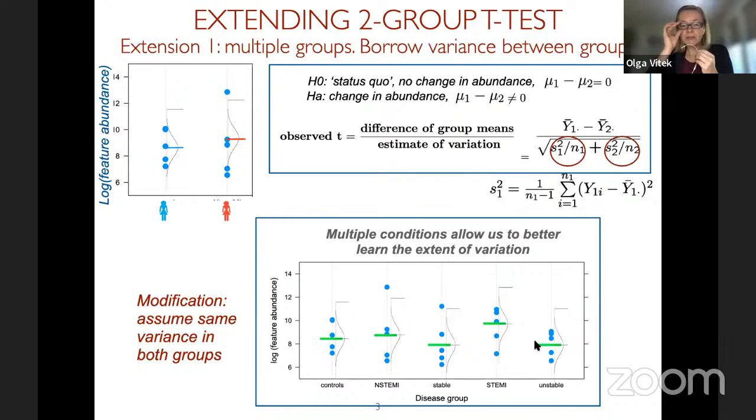And so the question was whether MSstats or MSstatsTMT can fit this type of models. The answer is yes, but only when it is appropriate for the experimental design. So we will need to see whether the experiment contains more than 2 groups, we also need to see whether all of these observations in each group can be assumed independent.